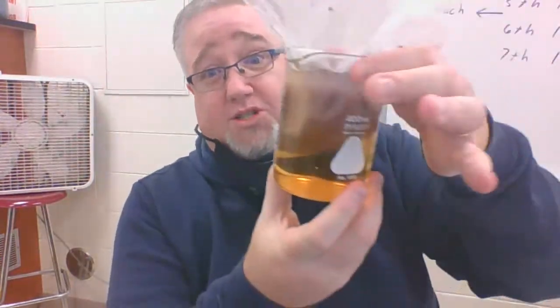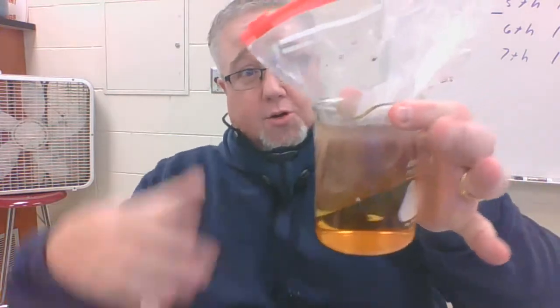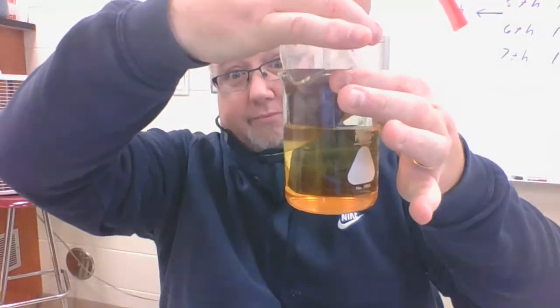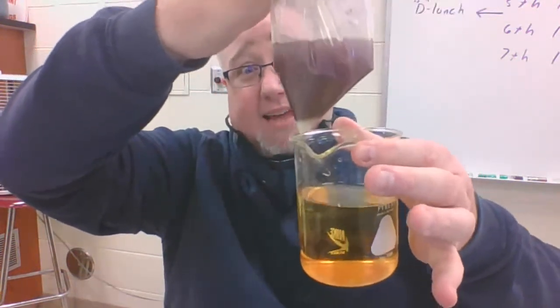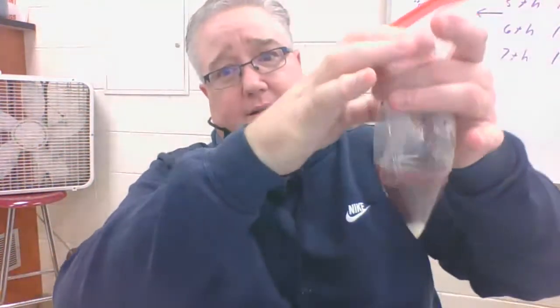All right, so if you've unpaused the video and answered some of the questions, you're now ready to look at some of the results. So this is the result of the experiment. I'm going to take this bag out. I probably should have put a towel or something up here. And this is the contents of our bag. Now you'll notice that the contents of the beaker haven't really changed. We still have that orange color that we had before. But you'll notice that the color of the contents of the bag has changed.